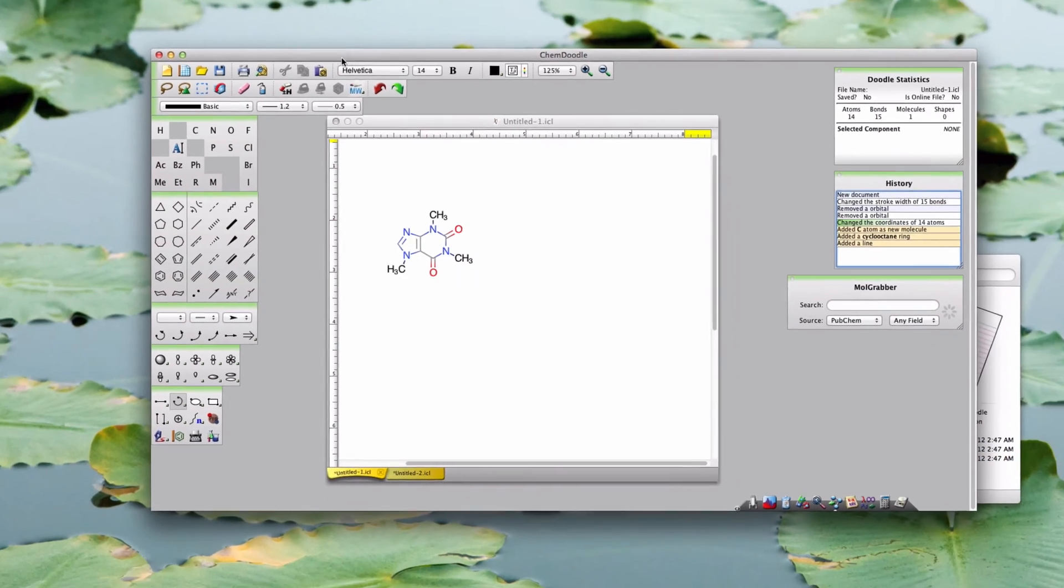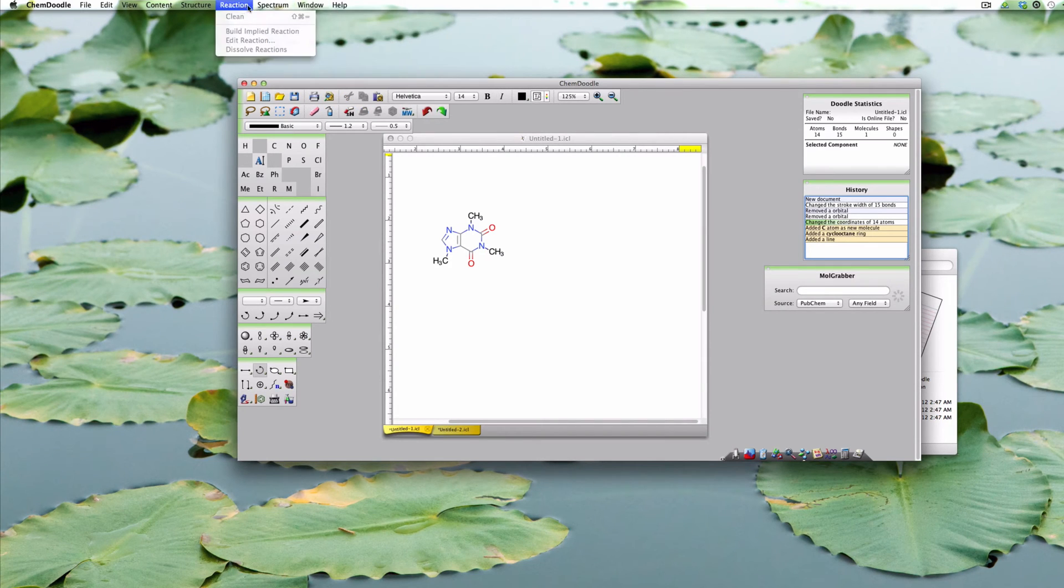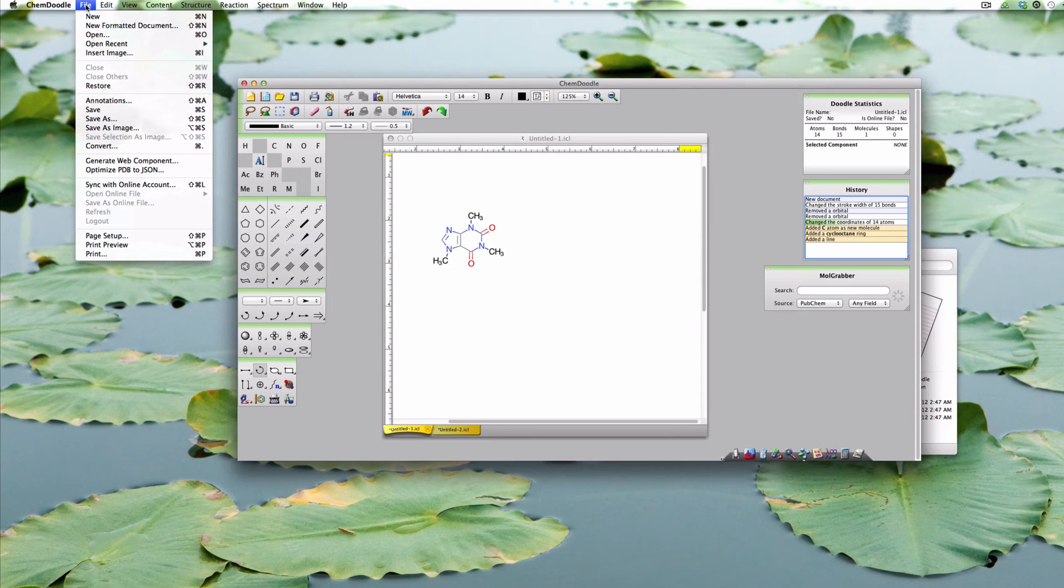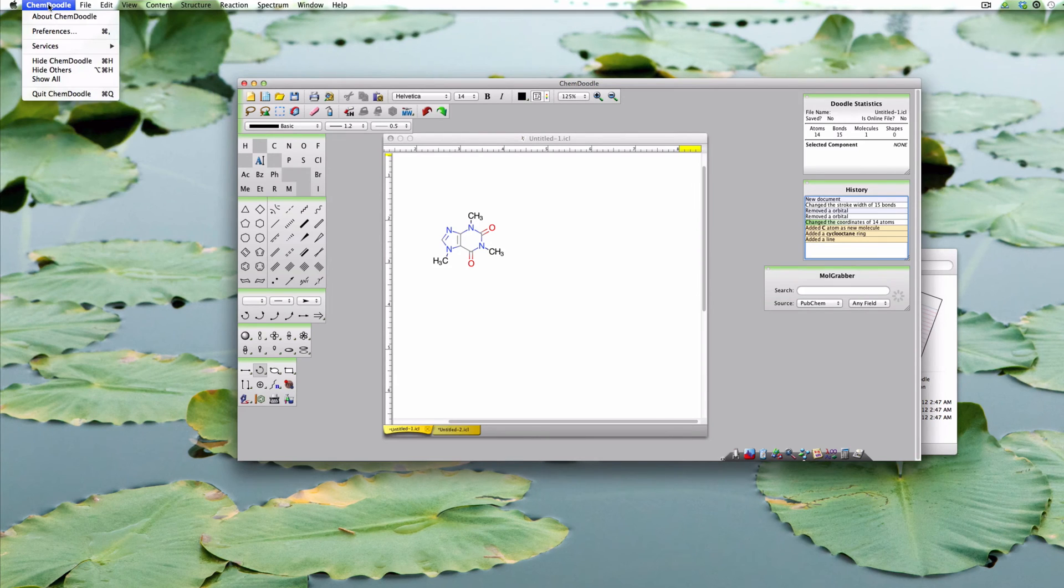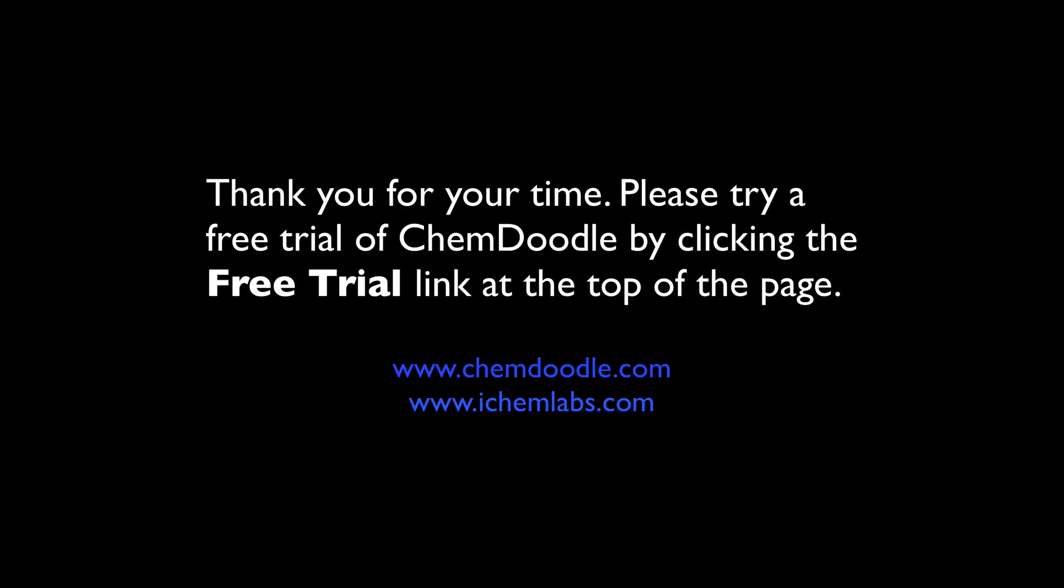On a Mac, you need to go outside of the workspace to find the menus. However, if you're working in Windows or Linux, the menu will appear at the top bar of the ChemDoodle interface.